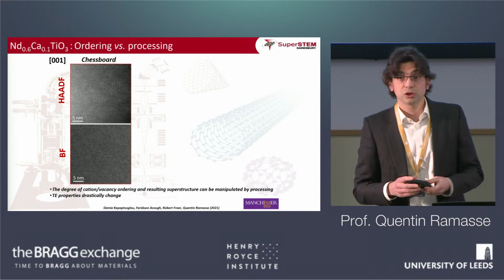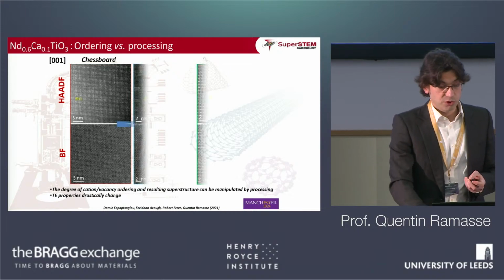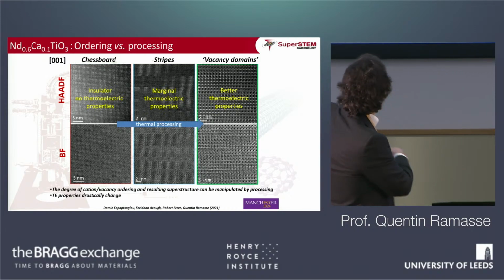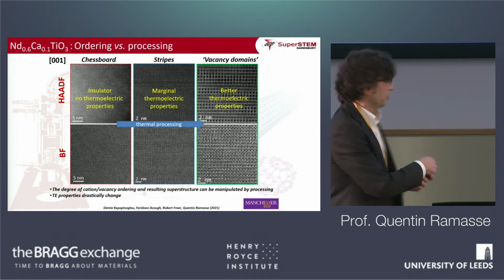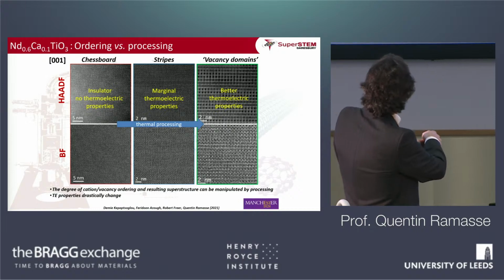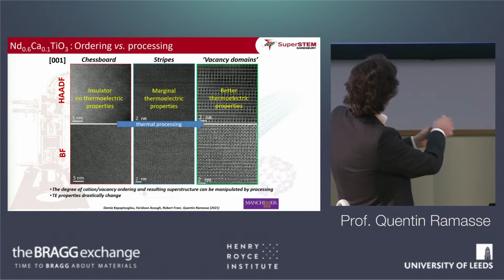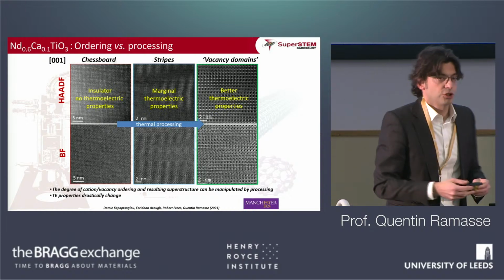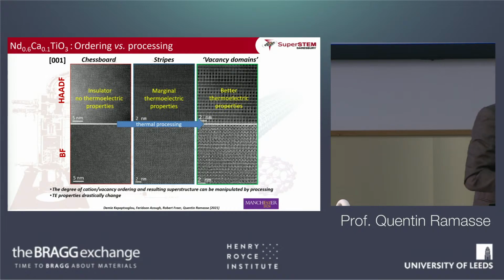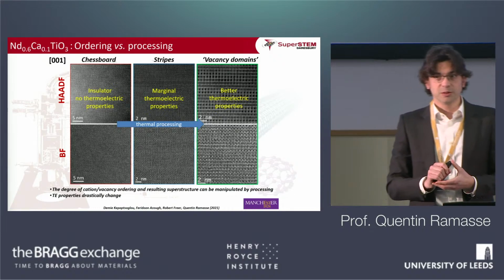So that's perhaps a good indication that this could be a thermoelectric material candidate. It turns out that it does work out quite nicely with this one single composition, depending on how you process it, just application of heat really. You go from a structure that has, hopefully it's visible from the back of the room, something that looks like a dash structure, checkerboard, to those bands that you see, to that rather beautiful A-site deficient structure that I was showing you at a slightly larger field of view earlier, and you go from, in simple terms, bad, good, better type of thermoelectric.